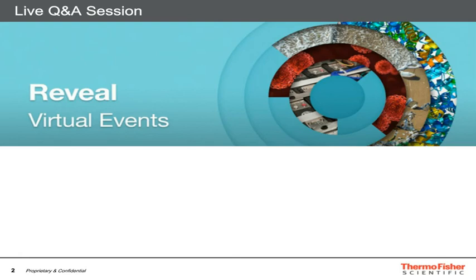Using this technique, we can enable live imaging of the phase of the transmission function in TEM. So we can use a very low electron dose and image light elements and heavy elements at the same time. We only need a very small dose of electrons, as I showed in the presentation.